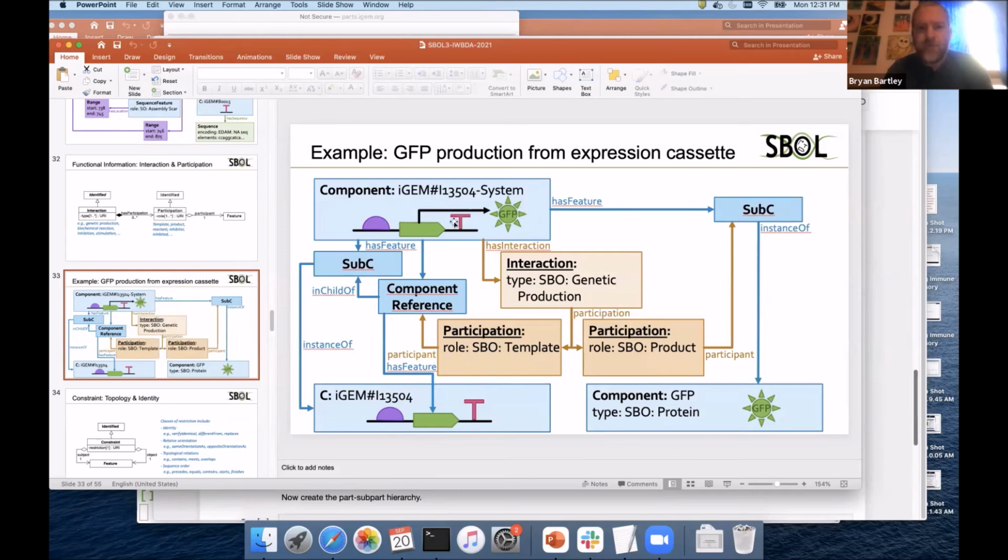Our high-level system representation also has this protein component that we're going to have to create. And then we have this component that represents the high-level system. In this system you've got a protein and you've got the DNA construct. So this is another good example of where you could attach sequences to both of these components, but the system itself has discontiguous sequences.